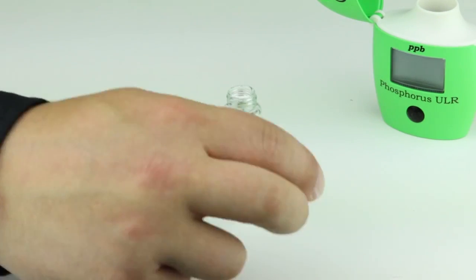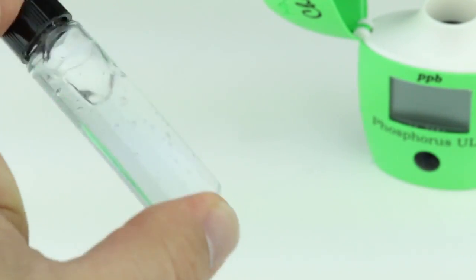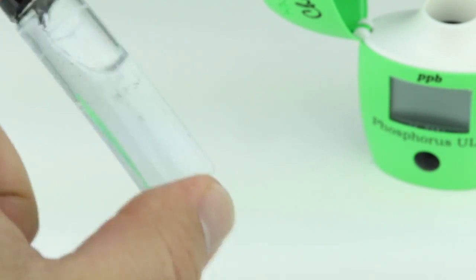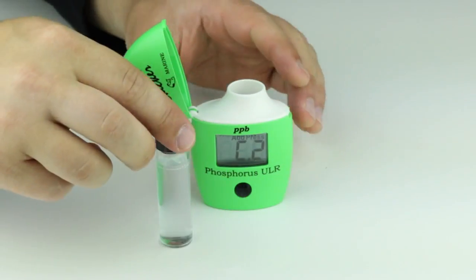Fasten the cap and shake gently for two minutes until the powder is completely dissolved. Wipe the cuvette of any oils and fingerprints and place it back into the meter.